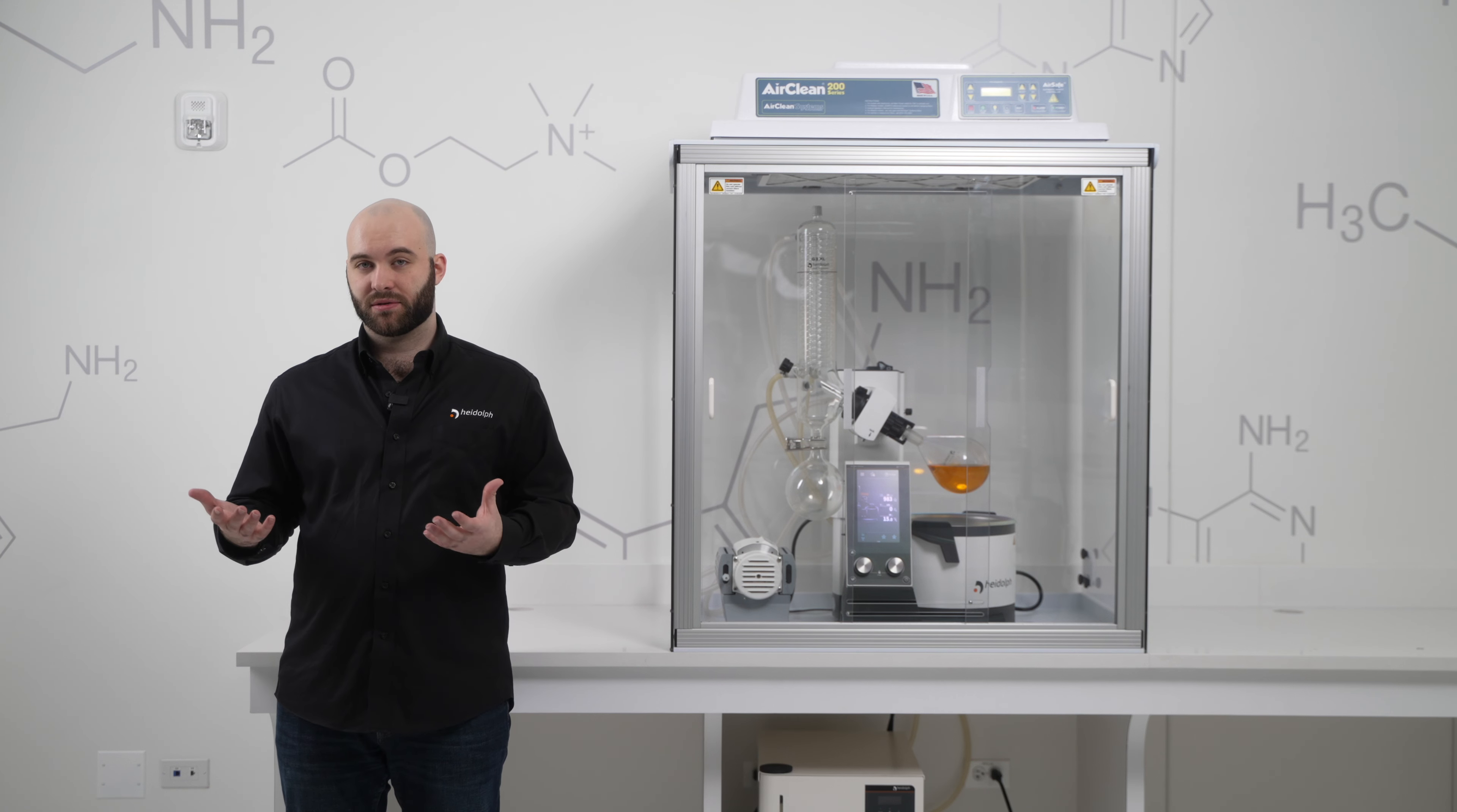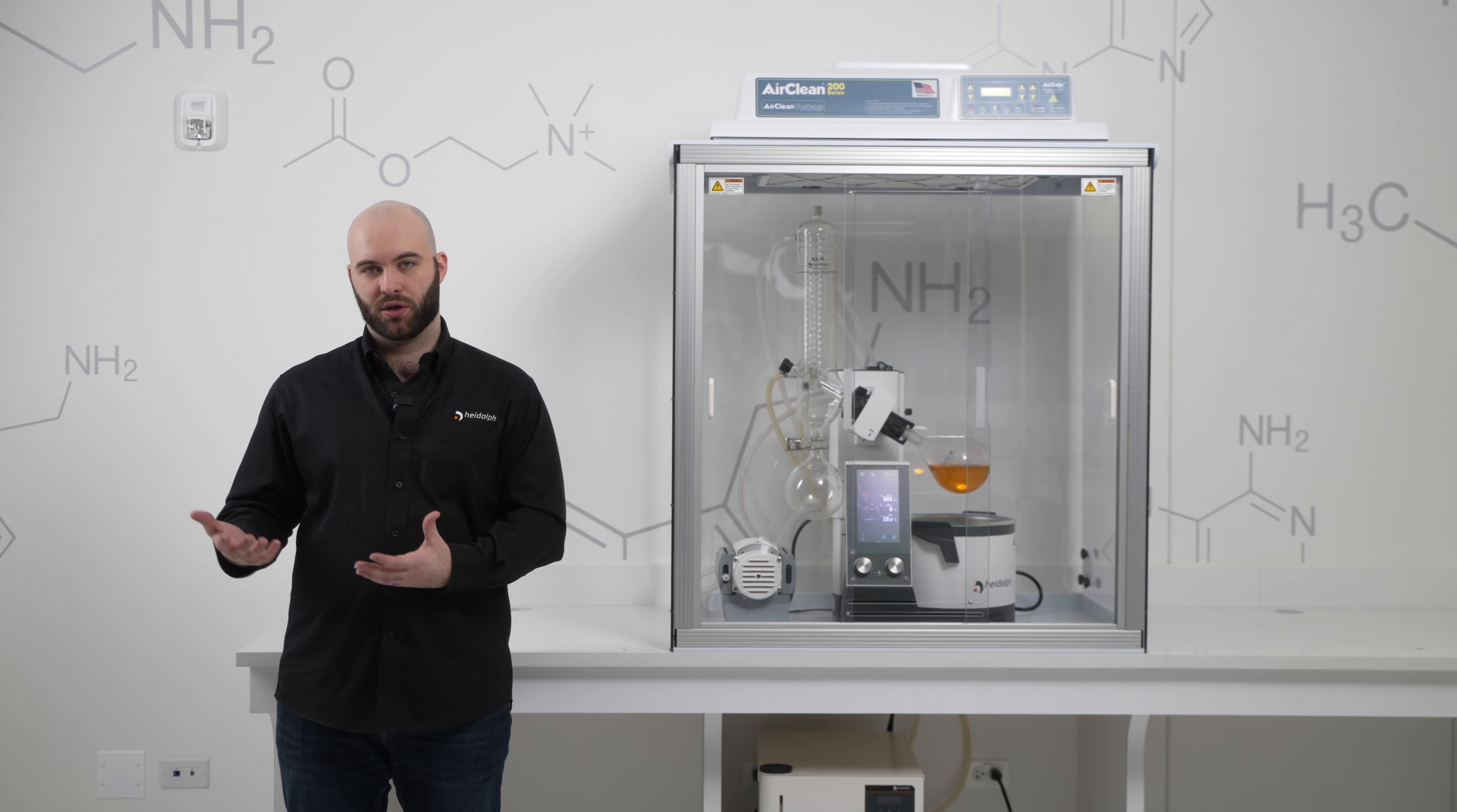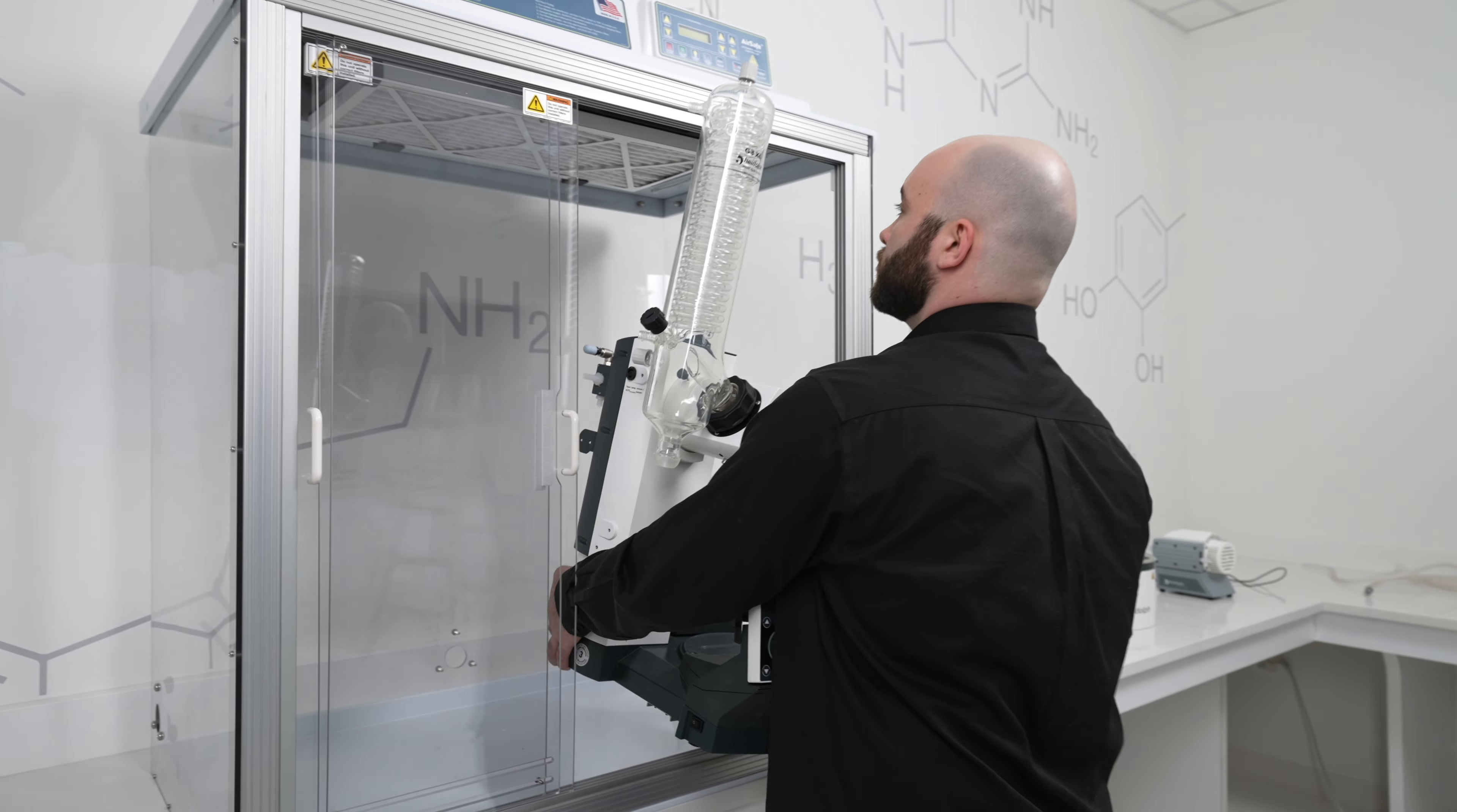When we operate our rotary evaporator, sometimes we're using solvents that can be potentially harmful to the operator or to the environment around it. In cases like those, you might not want to be doing it in your typical lab around all of your lab mates.